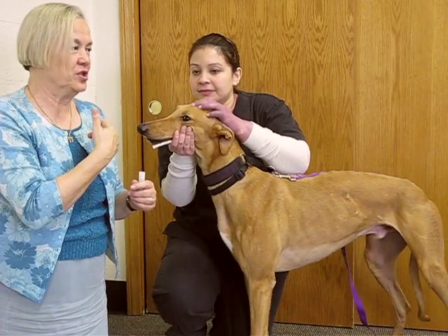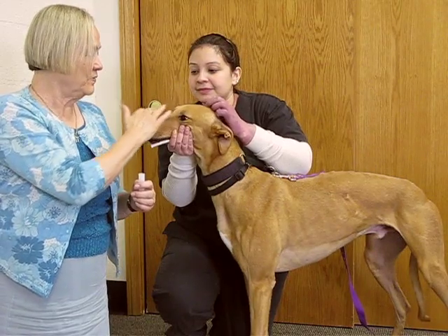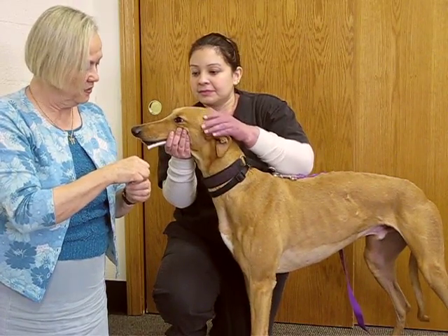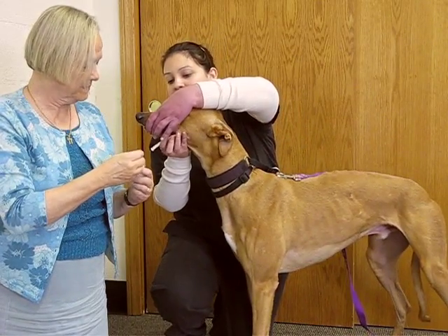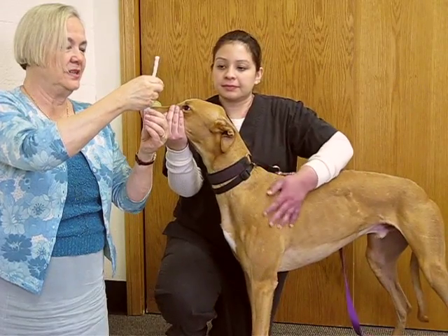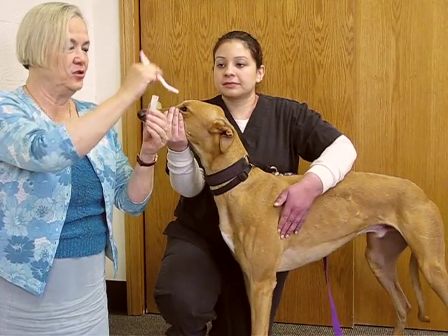Something that the dog would think would be just yummy would be perfect. We do this for about two minutes. And then once the saliva has been collected and the end of the rope is wet, we take it out of the mouth and put it into this double sleeve tube that's in the kit, and then we cut the top, and the wet part of the rope is in the inner tube.